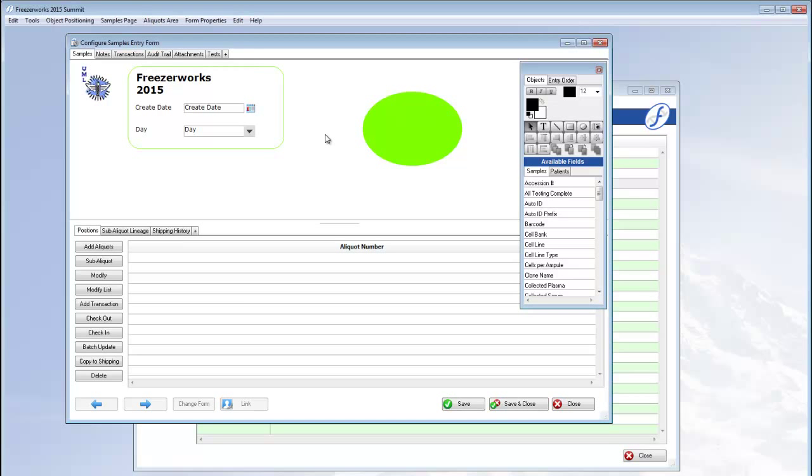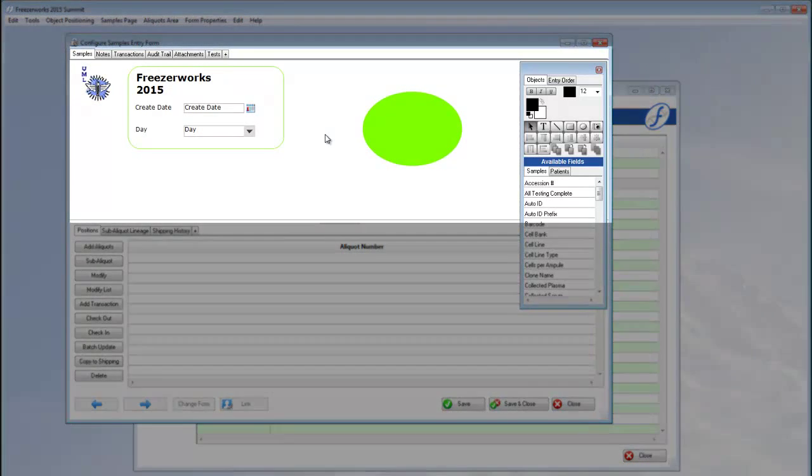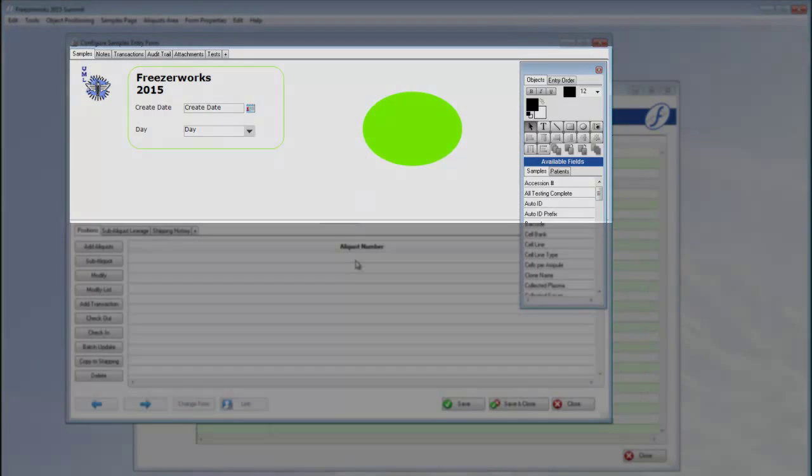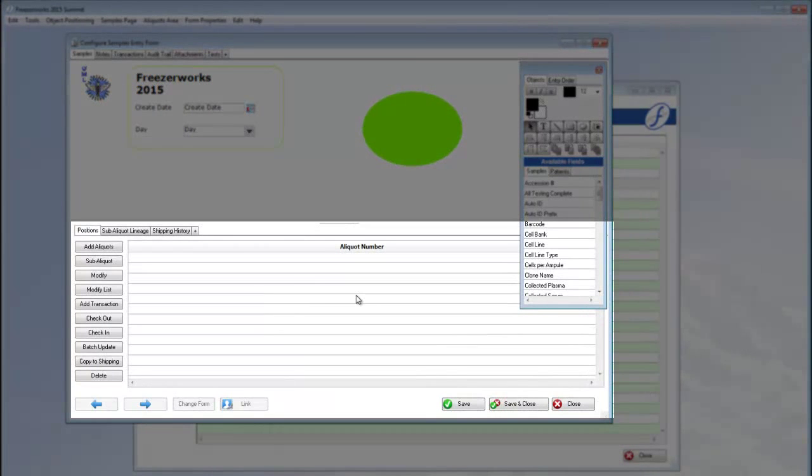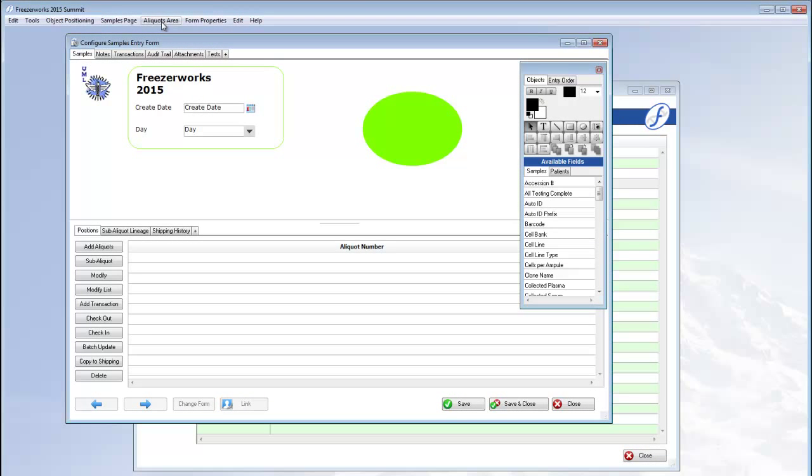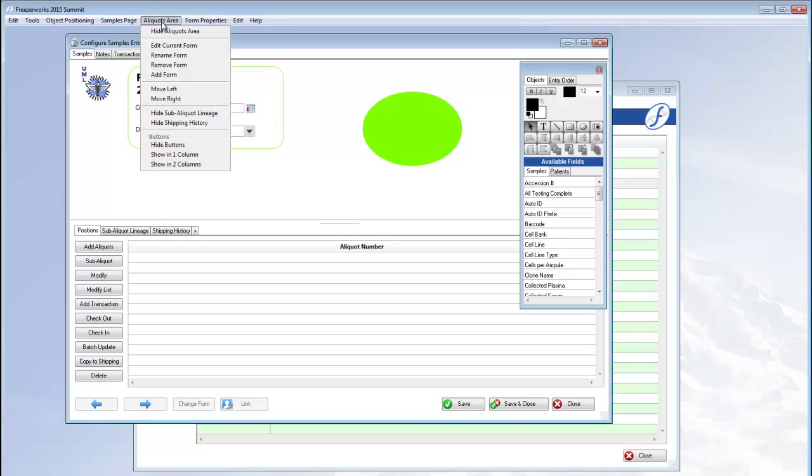The samples entry form is divided into two sections: the samples area and the aliquots area. You can choose to hide the aliquots area using the option underneath the corresponding menu.